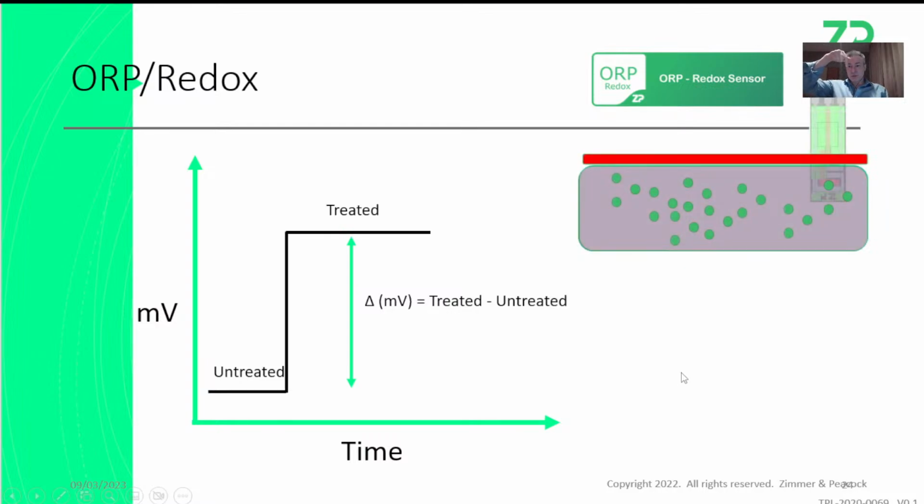You might want to do the experiment with these electrodes in the solution. I think this is the harder way to do it. My suggestion, in the first instance, is that you take an electrode, which I will link to in a minute, and you bring the solution to the electrode and you make a measurement. Whether you use a different electrode or the same electrode, I don't know at the moment. You have to do some experiments, because I'm just worried that in doing the measurement or bringing some material to the electrode, it will have changed it. But you have to do some wet chemistry or some wet biology to actually answer that question.